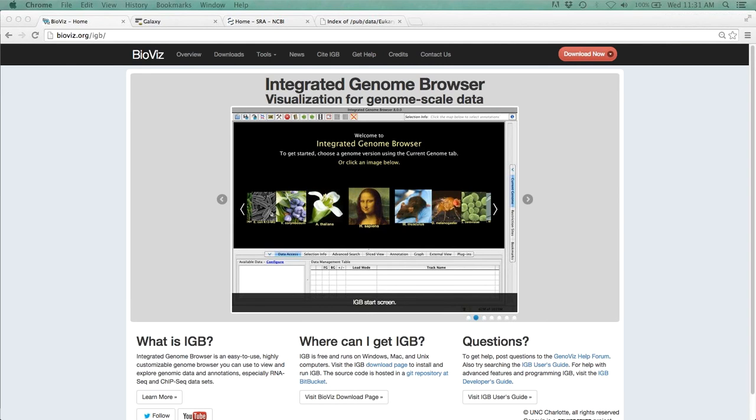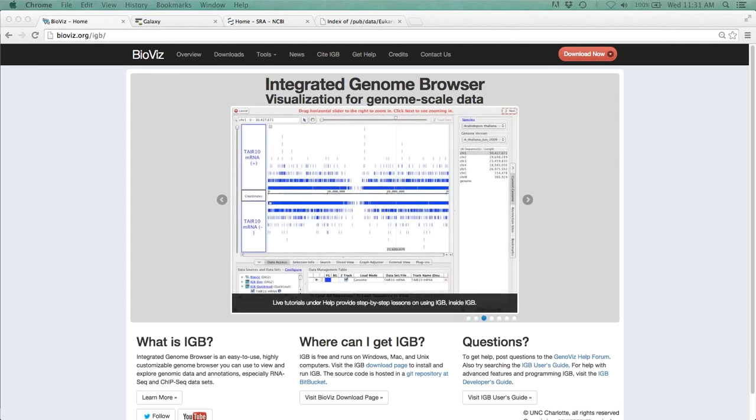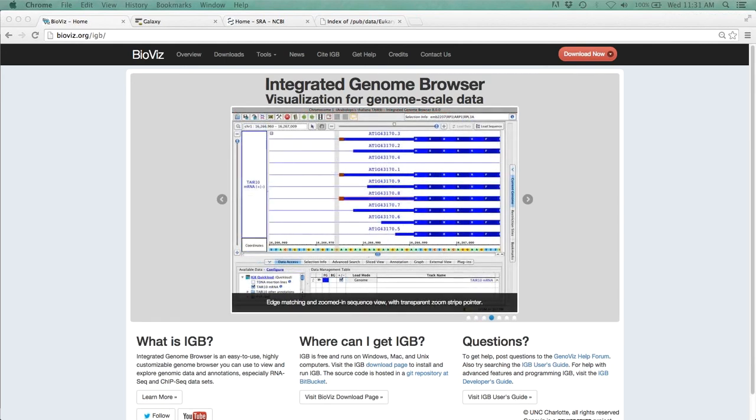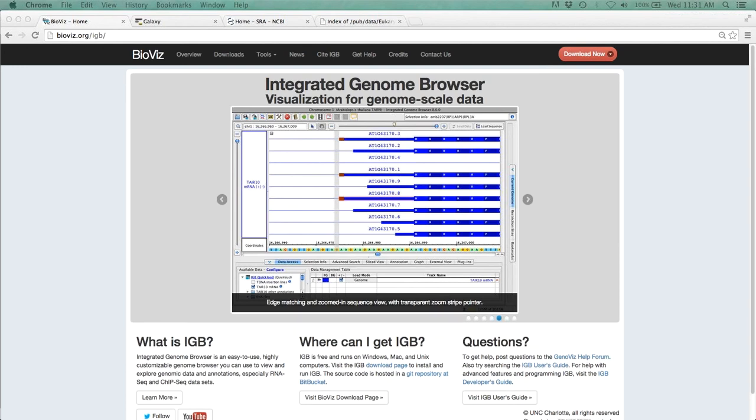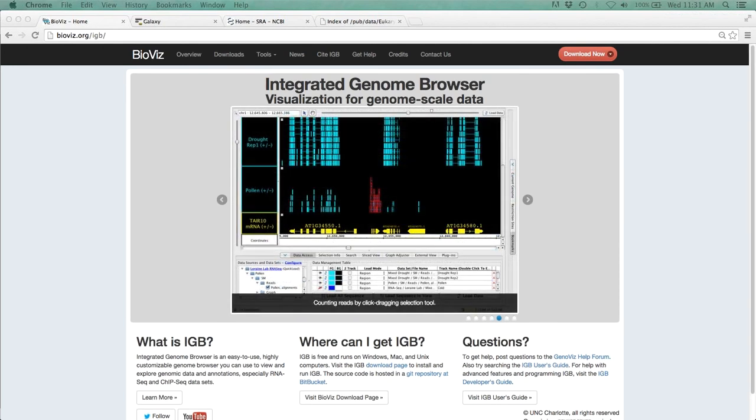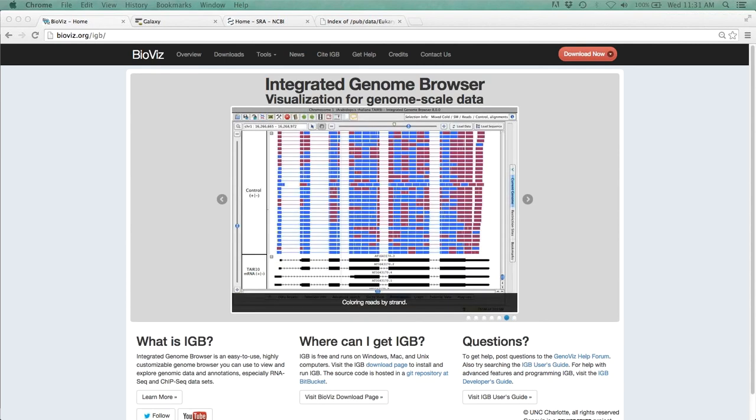The main key with the approach we are taking today is that it requires no programming. Everything will be done through a website called Galaxy. Galaxy is an open web-based platform for biomedical research. Many of Galaxy's functions require no programming experience and can all be done through its web browser.